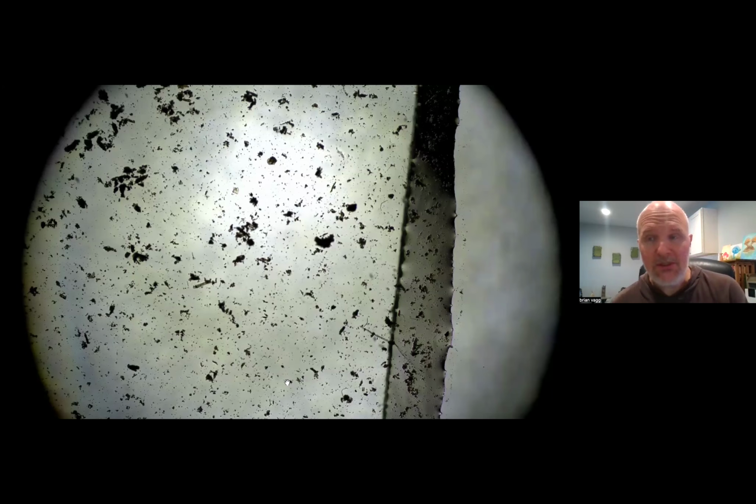The other soil sample I'm going to show you is from highly disturbed soil that comes from an area where I just put in a brand new greenhouse. And this will reflect the actual soil that I started with when I made this garden bed here. So we're going to take a look at the garden bed soil.